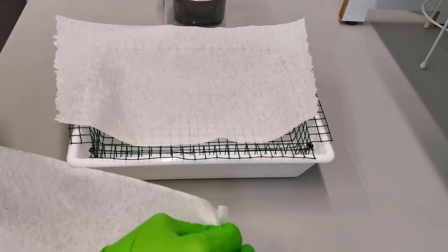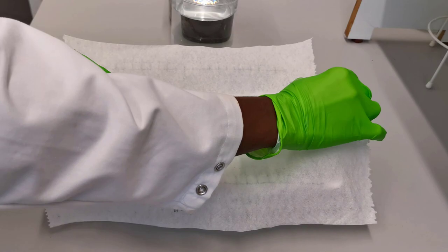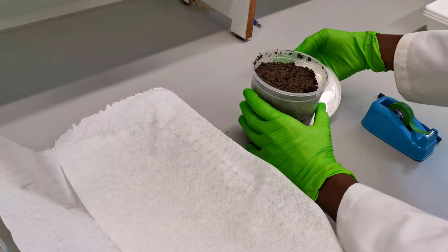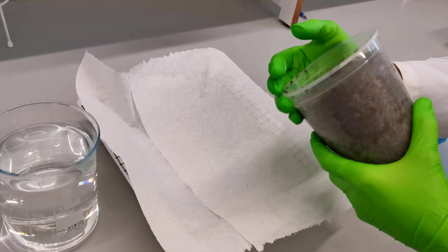To begin with the extraction process, place the tissue paper on the supporting wire mesh. Now spread out some soil on the tissue paper and make sure to break big lumps of soil. Depending on the aim of your experiment, you can also use a definite volume of soil.